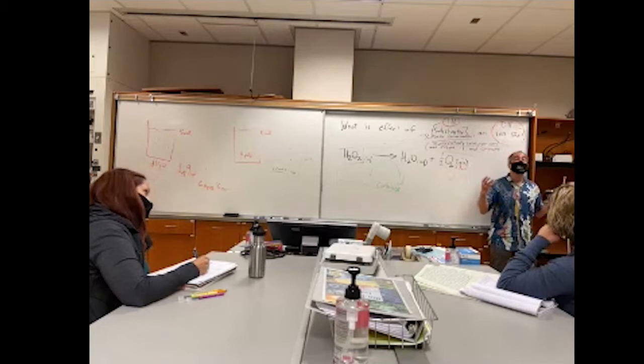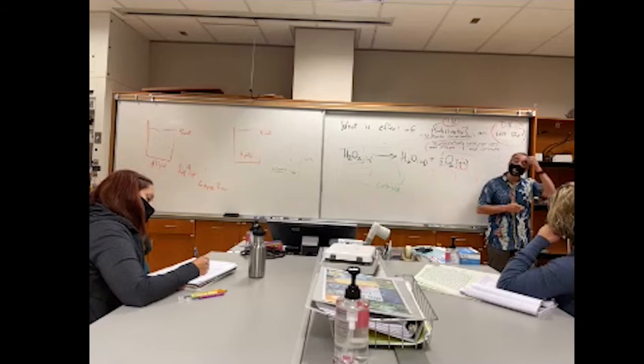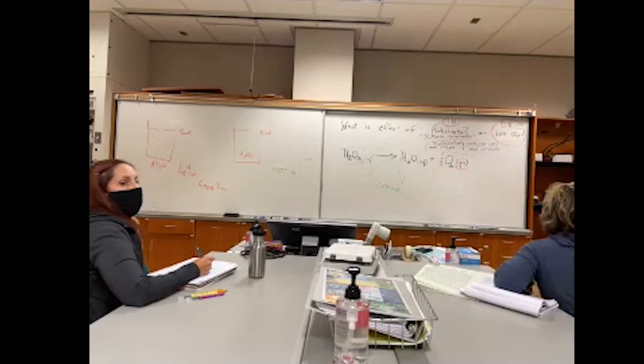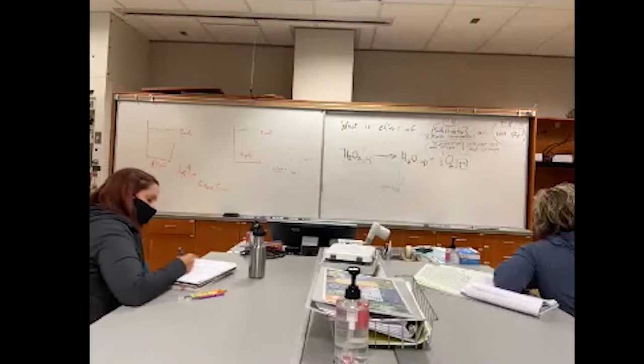The volume of the gas, or the bubbles being produced, are going to be noticeable. We'll see the bubbles. We can catch them. That's what we got these burettes for. We're going to have these burettes initially filled with water, but as the reaction goes, we have the little reaction vessel out through a little hose. The bubbles are going to come up here, and we can actually see the volume of oxygen being produced as it displaces the water in the burette.